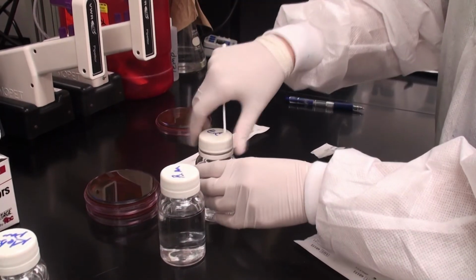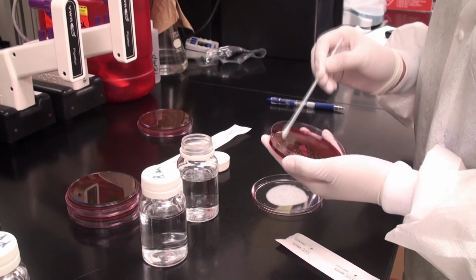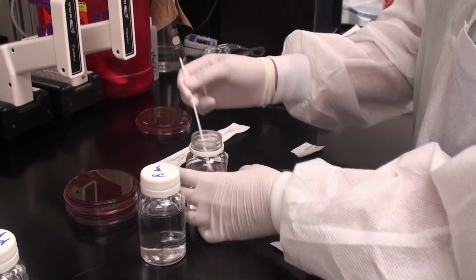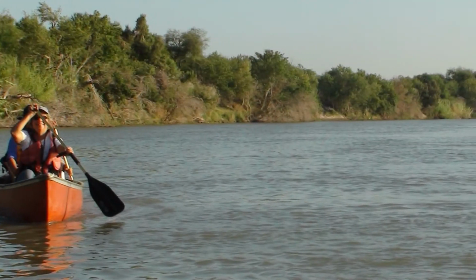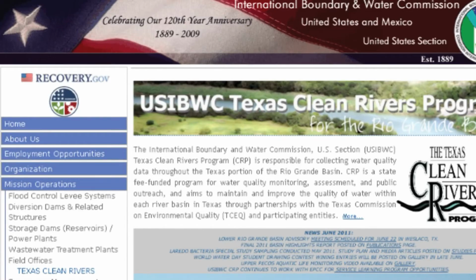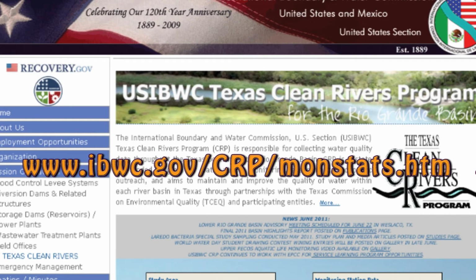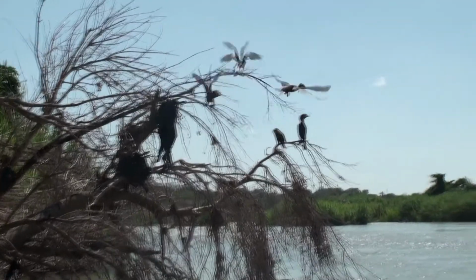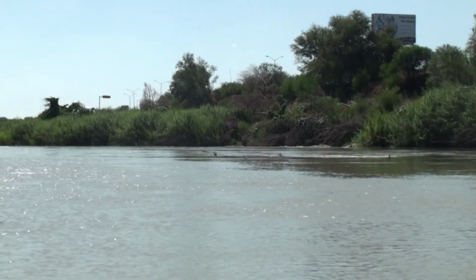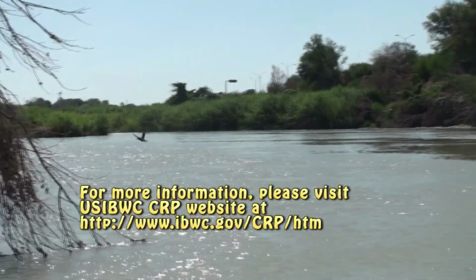The laboratory procedures to calculate bacteria levels in the river water can be complex, time-consuming, and expensive, but are necessary to determine whether the river is acceptable for recreational activities such as swimming and fishing. Results from the lab analysis are posted on the IBWC Clean Rivers Program website. The IBWC appreciates the support of its partnering laboratories, such as the Laredo Health Department lab, who performed the bacteria analysis for water quality monitoring in the Rio Grande.